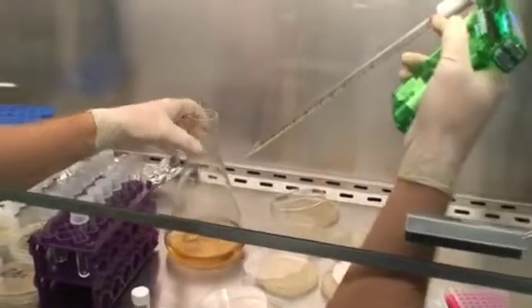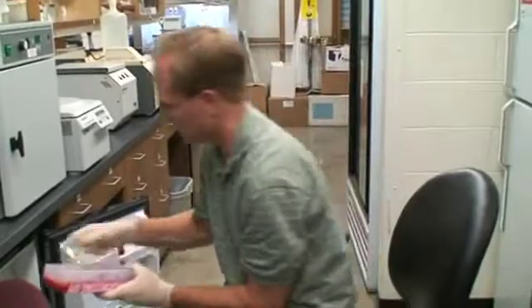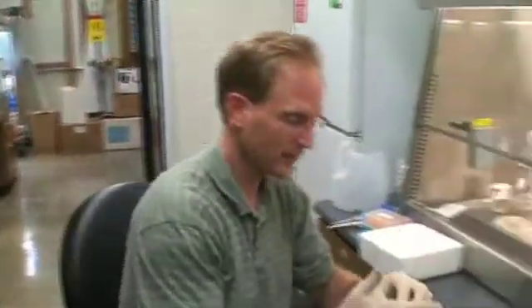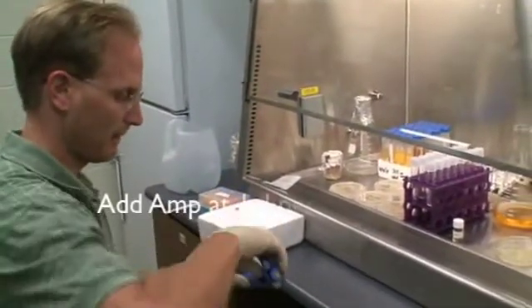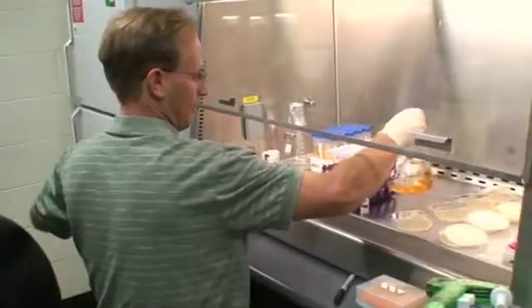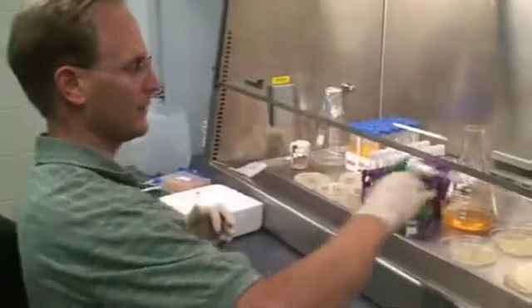We should add some antibiotic to this so that the only thing that's going to grow is our plasmid. I didn't make a crucial mistake, but I'm pretty confident that this will be sterile and that the only thing in there will be my samples. But just to be certain, we're going to put some antibiotic in that media, slosh it around, and then finish with the rest of them.